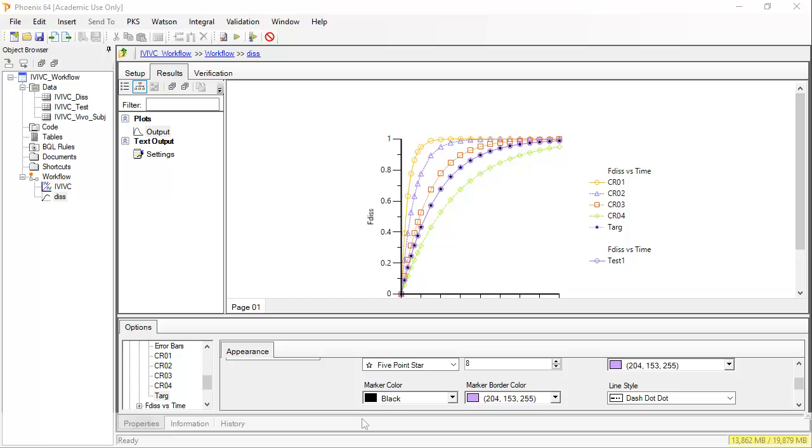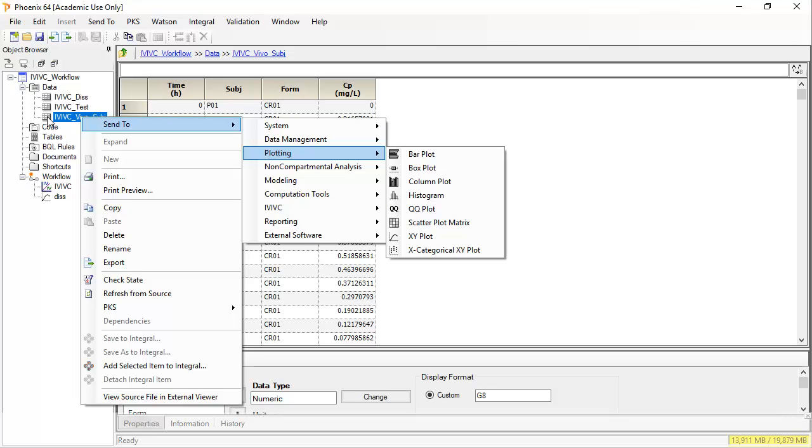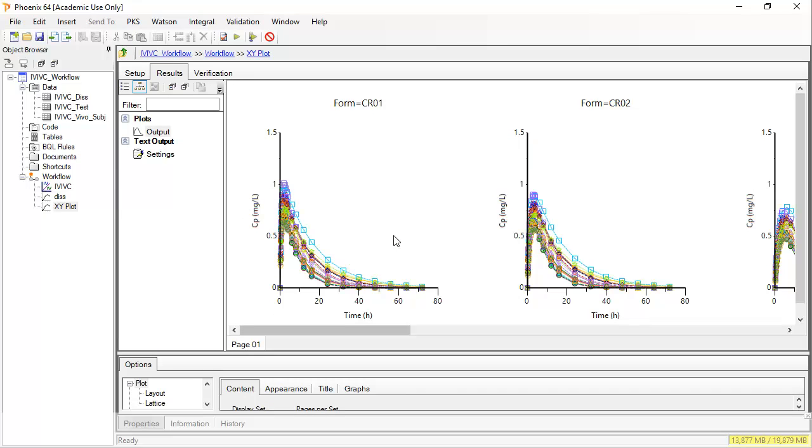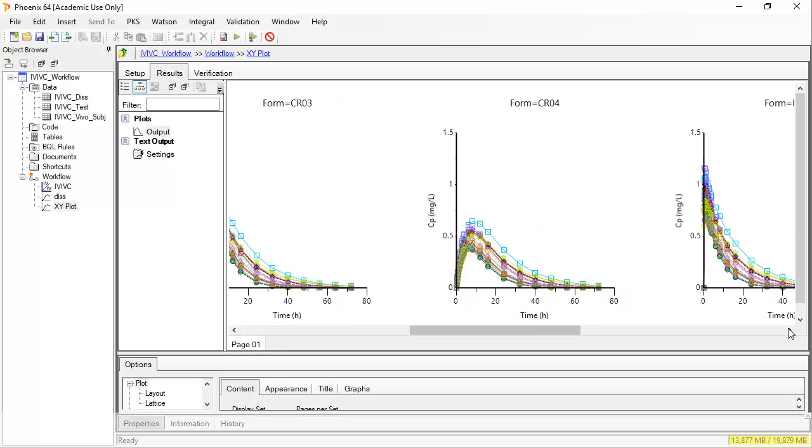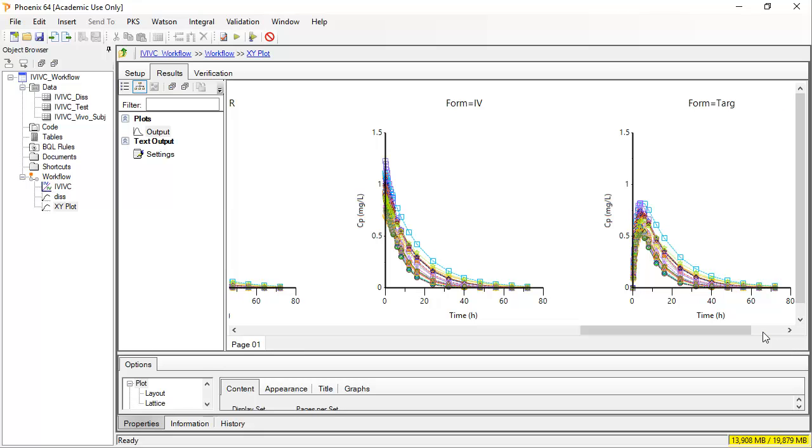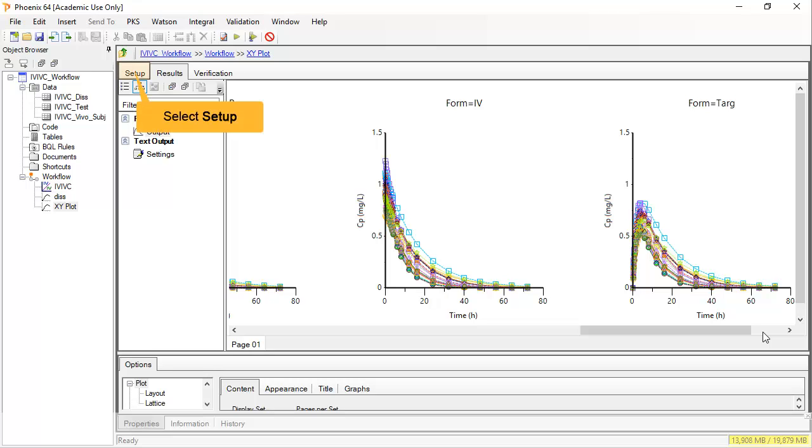Let's take a look at the available in vivo data. I can right-click to send this to a new plot object in exactly the same way. These are the results of plotting them with formulation as the column lattice and subject as a group ID. We see that in vivo, CR4 has the slowest release and the slowest absorption, and that every individual took all forms including the IV reference.